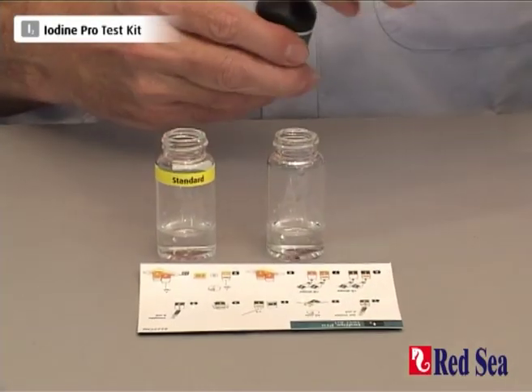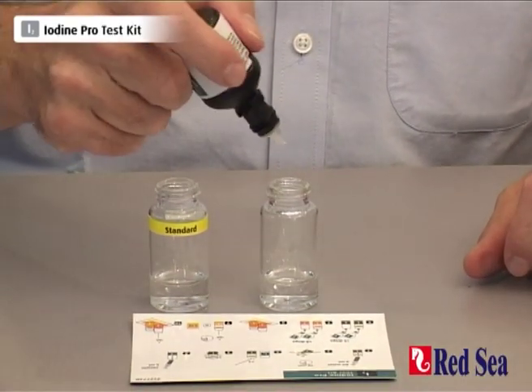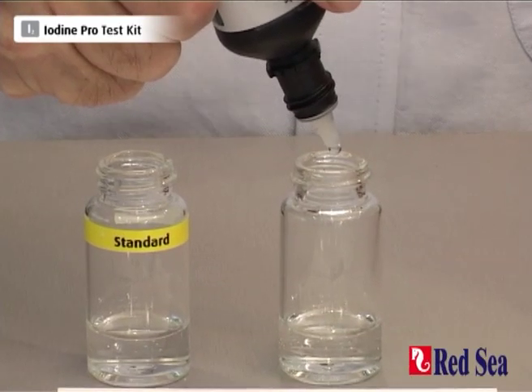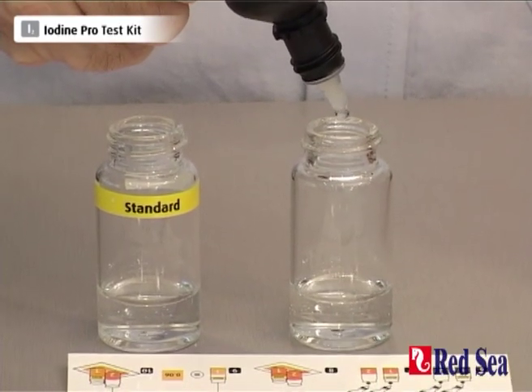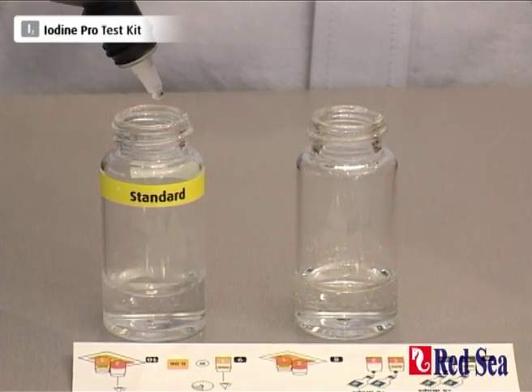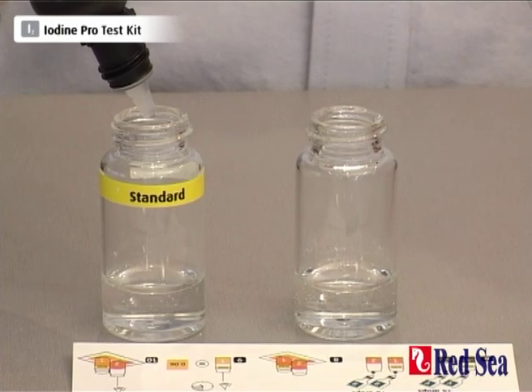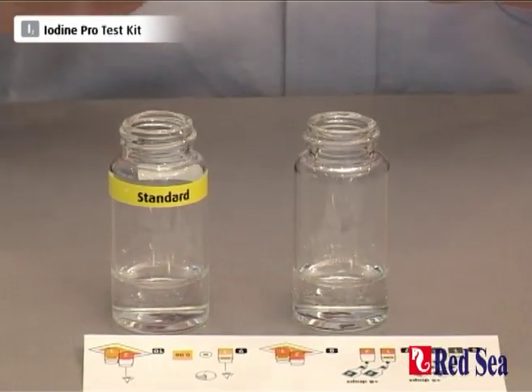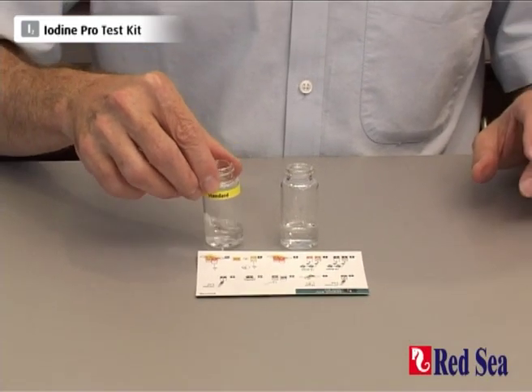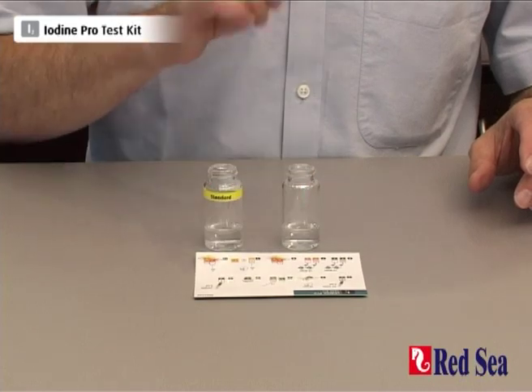We start with reagent A and we're going to add 5 drops to each vial: 1, 2, 3, 4, 5 — and 1, 2, 3, 4, 5. Always good to give the vials a little swirl to make sure of proper mixing.